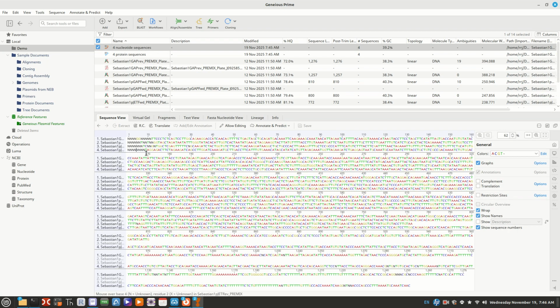Now, notice these Ns at the beginning. A lot of the time when you do sequencing, or actually you should say all the time, the beginning and the end are going to have Ns in them. Ns, if I didn't say it already, are when you do not know what letter it is. So it's ambiguous, so it's an N. We may have to go and trim these a little to get those out. We'll see how this works out.